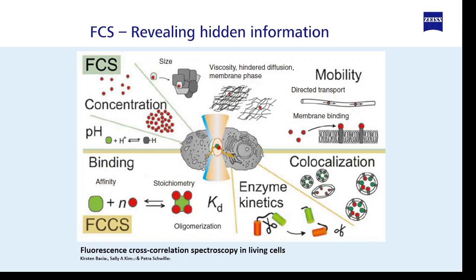We can get the information of how the molecule is transported, directly or through membrane binding, or whether it has some hindrance, and we can get the information about the molecular size, like whether it's a monomer or dimer or oligomer during its functioning.